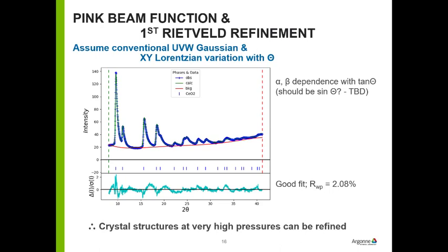A lot quicker. So I had to discover what the dependence of the various coefficients are. And anyway, the point is one can do crystal structures at ridiculously high pressures that are created under these conditions.